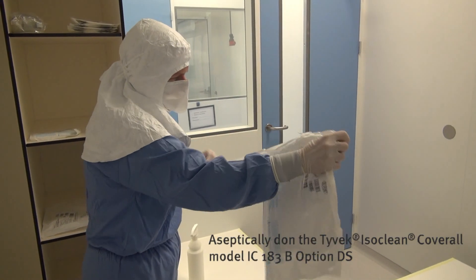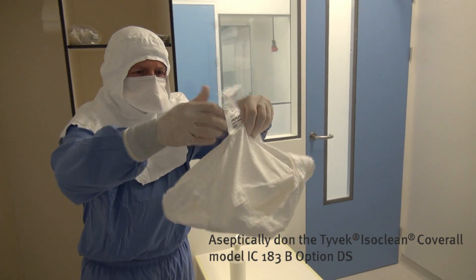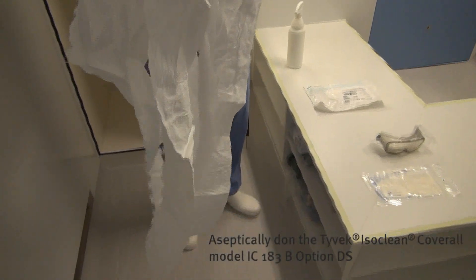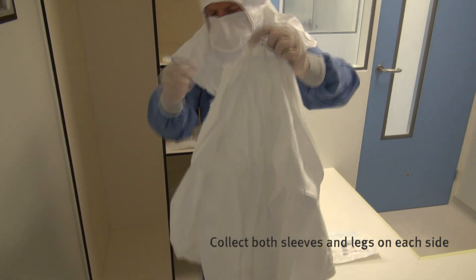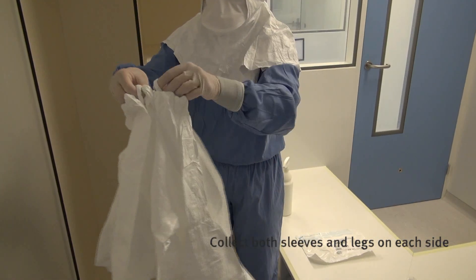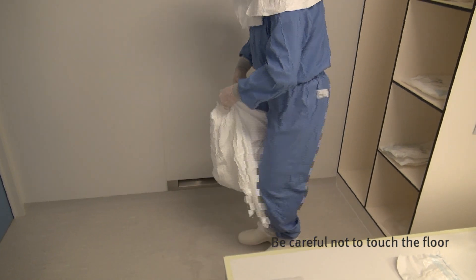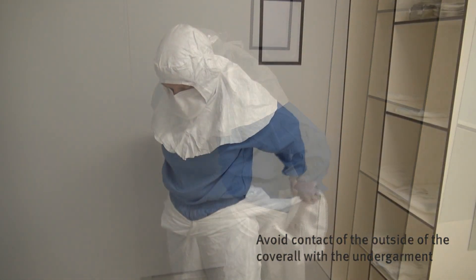Aseptically don the coverall. Carefully unpack the Tyvek ISOClean coverall and unfold it gently. Be sure the coverall does not touch the floor. The outside of the coverall may not touch your undergarment. Apply the demonstrated technique to don the coverall aseptically. Collect both sleeves and legs on each side. Be careful not to touch the floor and avoid contact of the outside of the coverall with the undergarment.